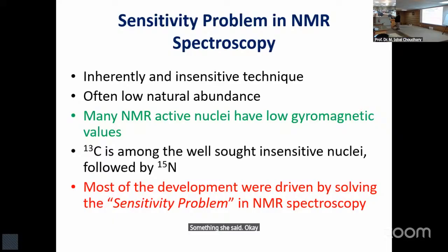Okay, who else? One, low population difference, because of abundance also. Low population difference. Why low population difference?